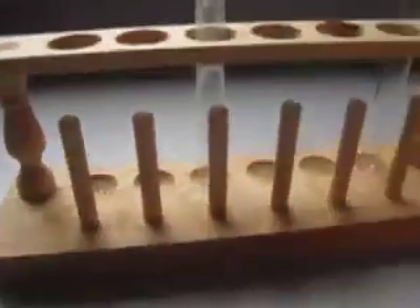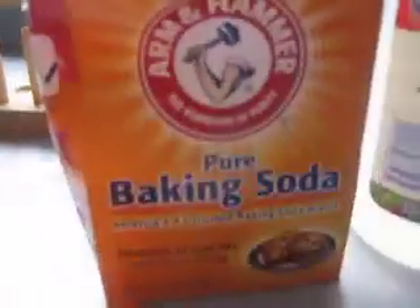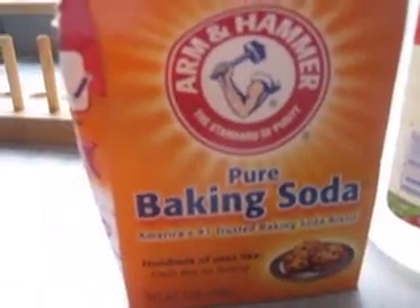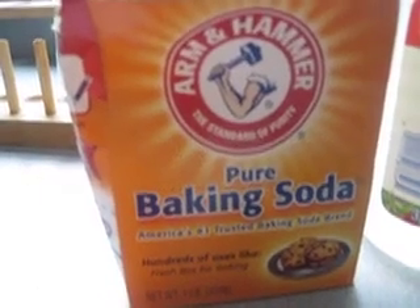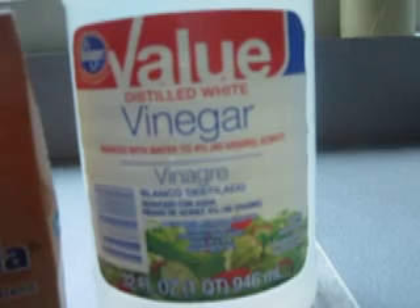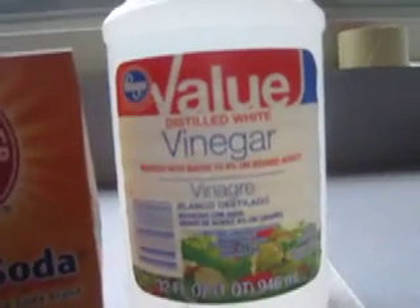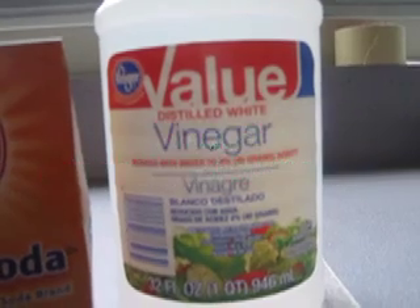Then we've got this test tube stand — as you might see, there are two test tubes present. And then we also have pure baking soda, Arm & Hammer, which is also known as sodium bicarbonate, also known as NaHCO3. And then we have distilled white vinegar. This is distilled, so it's not 100% vinegar — it says reduced with water to 4% — which is also known as CH3COOH.